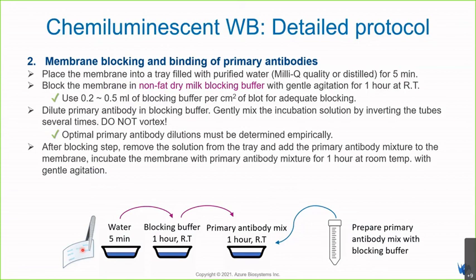Put it in a tray filled with purified water for 5 minutes just to wash off the transfer buffer. After that, transfer the blot to a tray filled with blocking buffer. Here we use non-fat dry milk blocking buffer with gentle agitation for 1 hour at room temperature.